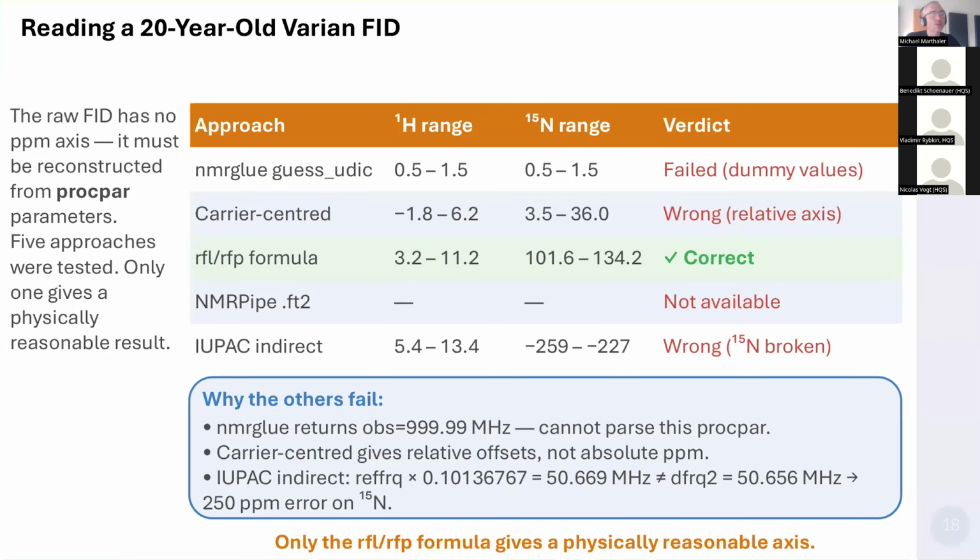Now, why was the 1H axis of the comparison so off between the Varian measured data from Zenodo, in blue, and the orange points from BMRB? So with old Varian data, the free induction decay, time domain data, if you Fourier transform it, you don't immediately know what the center frequency is. So there's no obvious frequency scale that centers it.